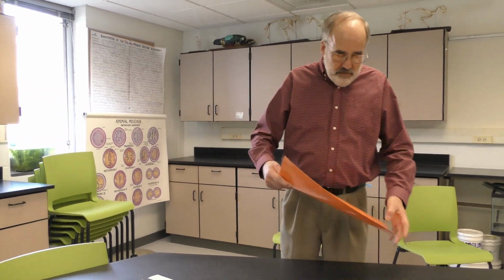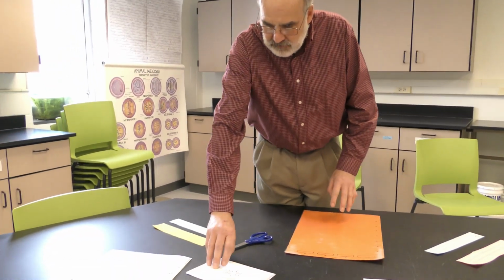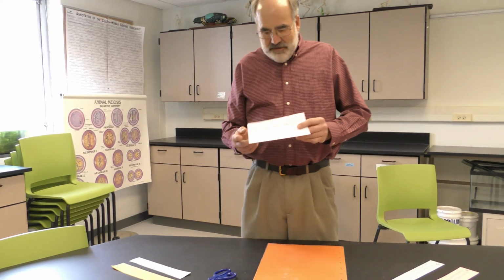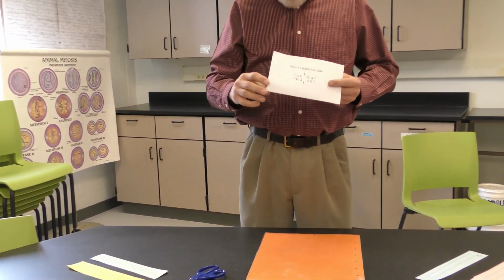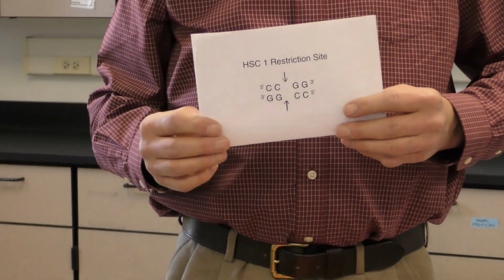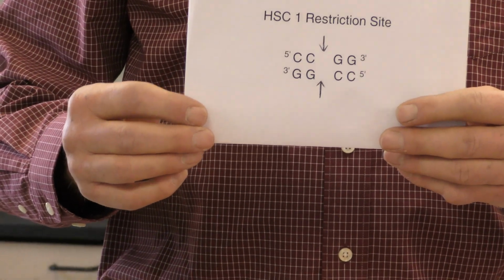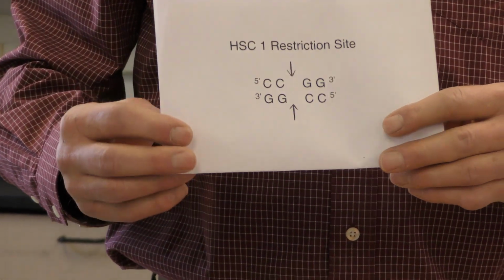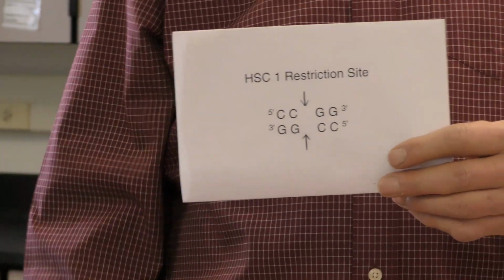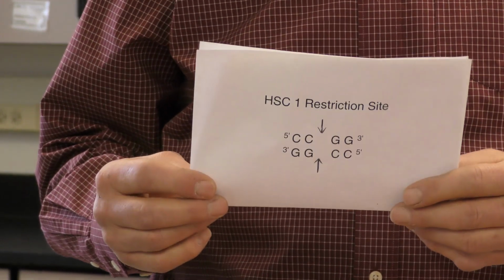So, how can we model this? If you look in your lab manual, we've created a restriction enzyme. Remember, restriction enzymes are enzymes that very specifically cut DNA at precise sites. I often ask my students, what is the source of these restriction enzymes? Where do we find them in nature? Think about a group of organisms where restriction enzymes would be important, and think small.